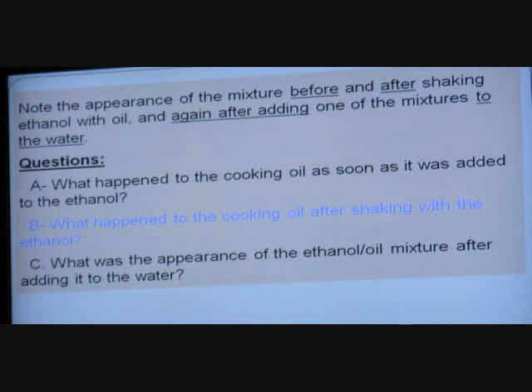I also want to try adding some detergent — I want to see it lift that grease. I'm going to move to my central station in a little bit.